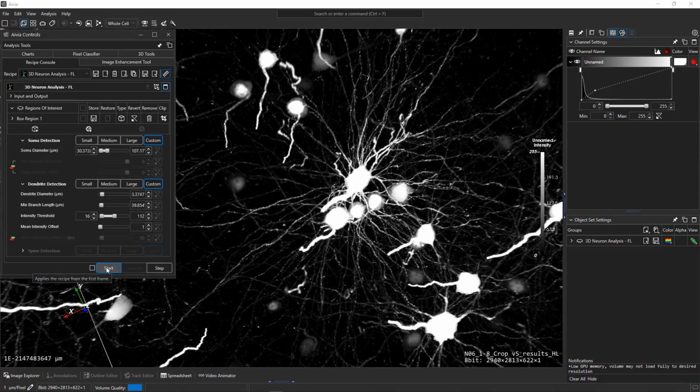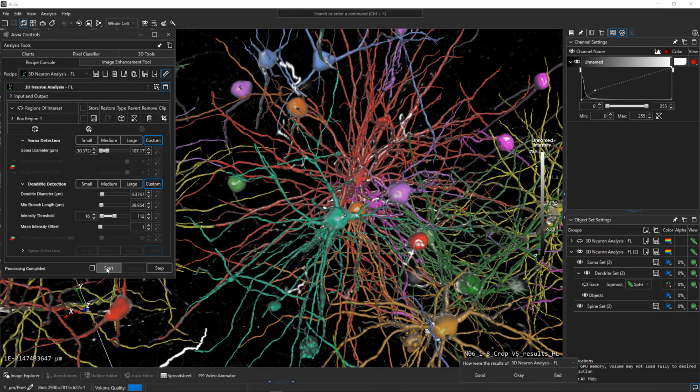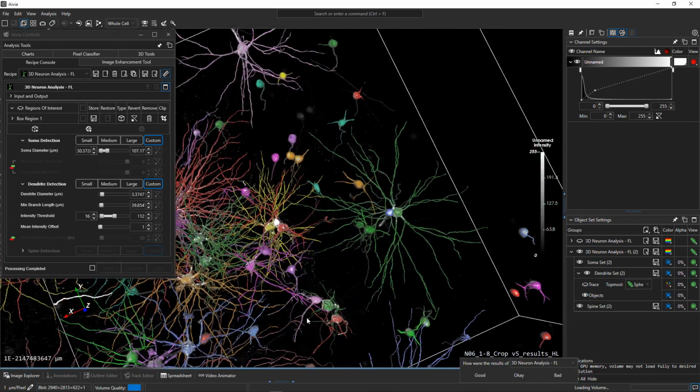We can now apply them and wait for a moment until all the results are applied. Typically, on average, it takes 4.5 minutes to apply. I don't know if this data set will be exactly 4.5 minutes, a little bit more, a little bit less, but we'll wait until the results are visible. All right, that has completed. And let's have a look if the results are good enough.